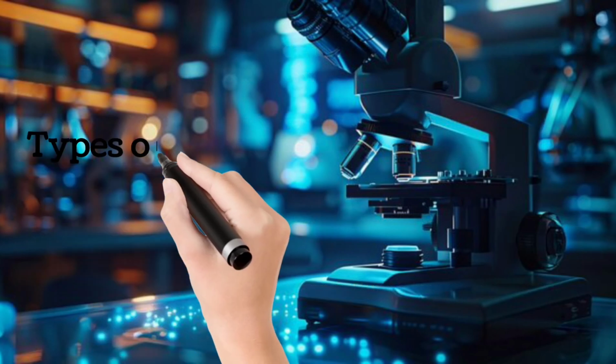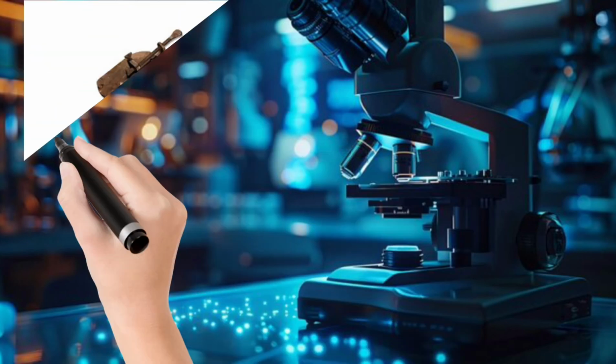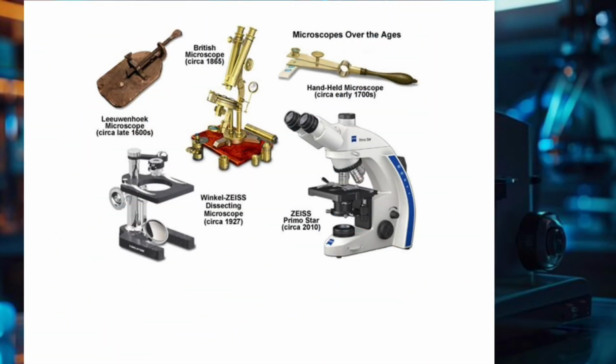Types of microscope. Simple microscope, compound microscope, electron microscope, stereomicroscope, scanning probe microscope.